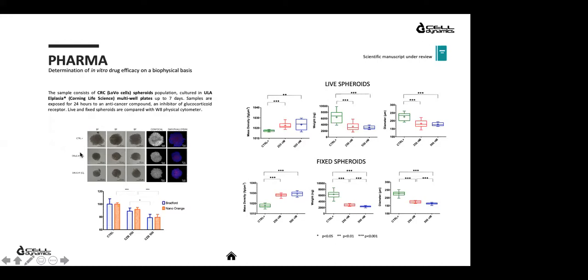With the preliminary investigation with bright field and confocal microscopy, we can see that spheroids look more compact after drug exposure. If we look at the borders of the spheroid, they are more regular in the treated sample compared to the positive control. Probably this is the effect of the drug exposure, since we have a collapse in our sample.